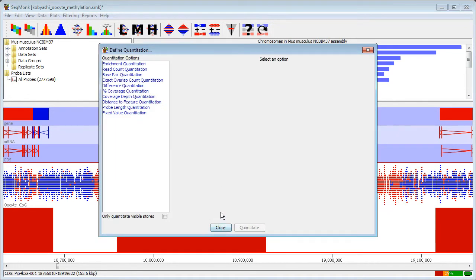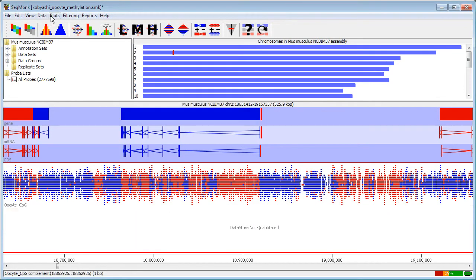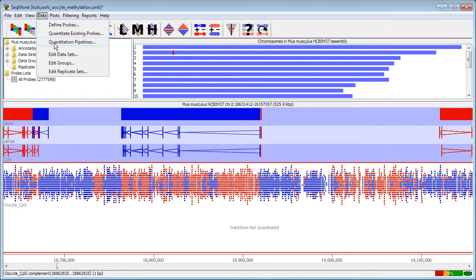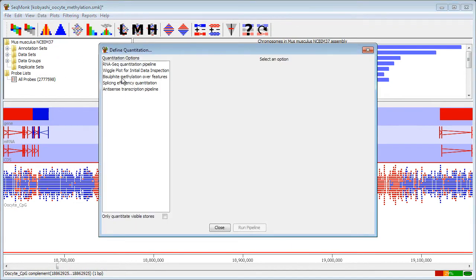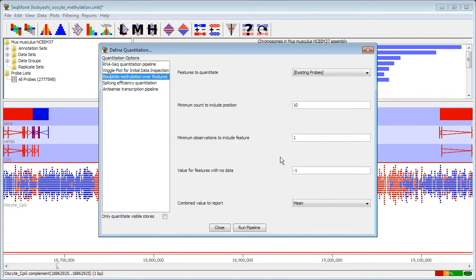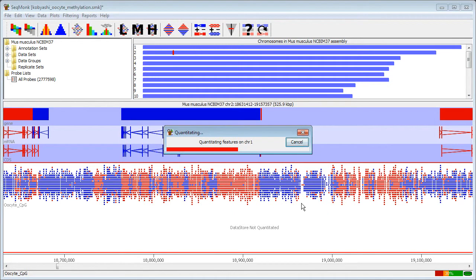To quantitate these I'm not going to use a standard quantitation but I'm going to go back to the quantitation pipelines and do a bisulfite methylation over feature pipeline using the most lax settings and run this. This will take a little time to calculate so I'm going to pause the video here until it's complete.